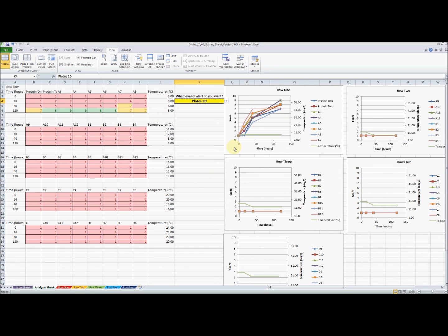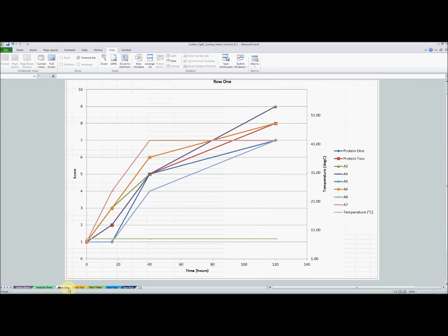You get a thumbnail graph of what's going on, and then you have effectively the TG40's matrix, which is color-coded relative to this filter. If I drop this down to clear drop, just about everything became good. But if I start being more stringent in what I'm interested in, then most things are red and the greens. And for your analysis, there are also these zoomed in views as well.